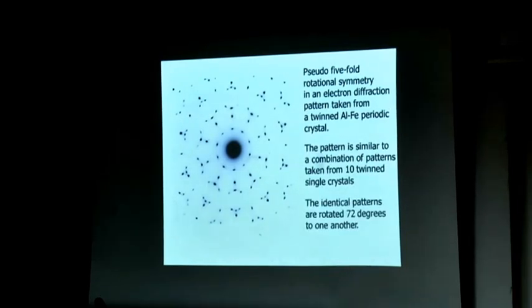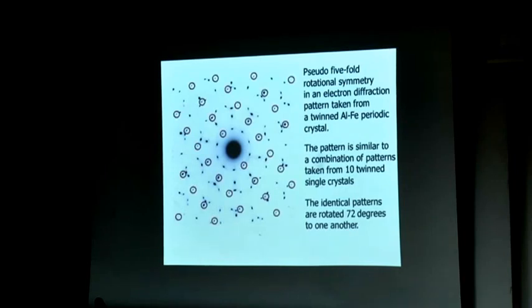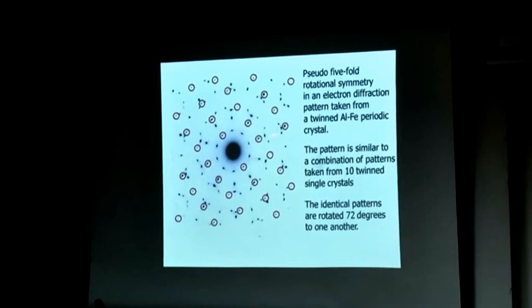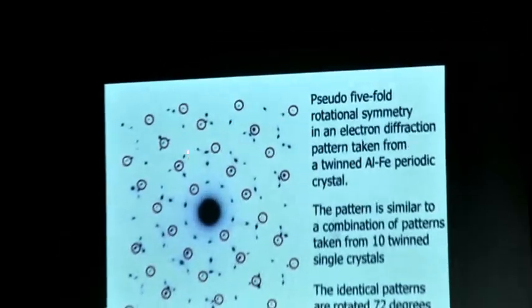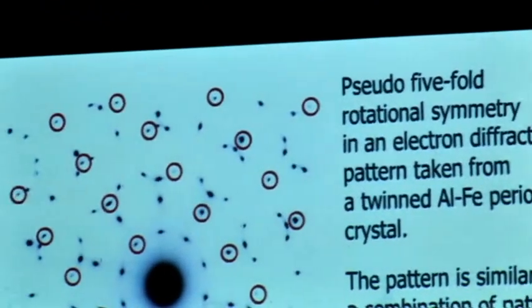This is what I thought I had because I had this experience before. And this is why I performed a series of experiments. Here is one, by the way. This is one diffraction pattern, and you have five of them. And this is periodic, as you can see. Periodic in each and every direction, right? Periodicity here, and so on.